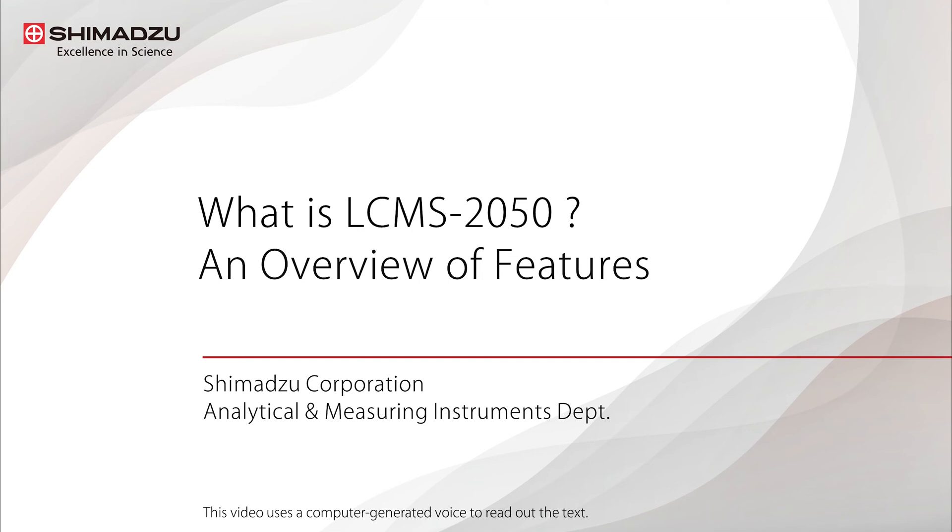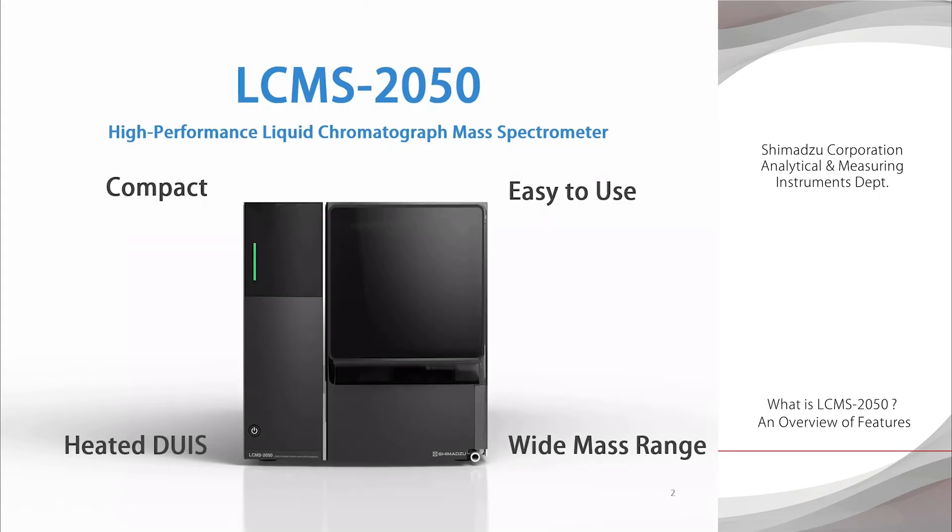What is the LC-MS 2050? This video is an introduction to the features of the LC-MS 2050, Shimadzu's latest single-quadrupole liquid chromatograph mass spectrometer. Thanks to its size and ease of use, the LC-MS 2050 system can be used in the same way as an LC system, even by those unfamiliar with mass spectrometers. This single-quadrupole LC-MS system is the first in the industry equipped with a built-in heated DUAS, or dual ion source, enabling the ionization of a broad range of compounds with a variety of physical properties. It also has a wide mass range, so it can analyze a variety of compounds ranging from low molecular weight to high molecular weight.